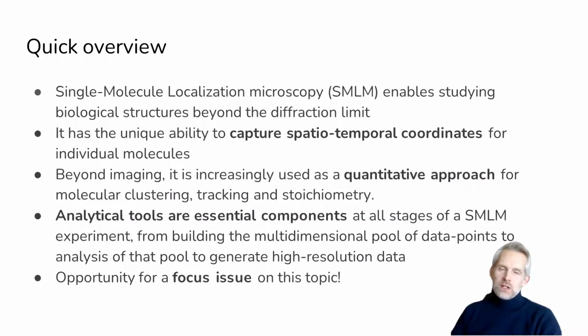So single molecule localization microscopy enables us to study biological structures beyond the diffraction limit. It has the unique ability of capturing spatio-temporal coordinates for individual molecules. But beyond imaging, it is increasingly used as a quantitative approach for molecular clustering, tracking, and stoichiometry.